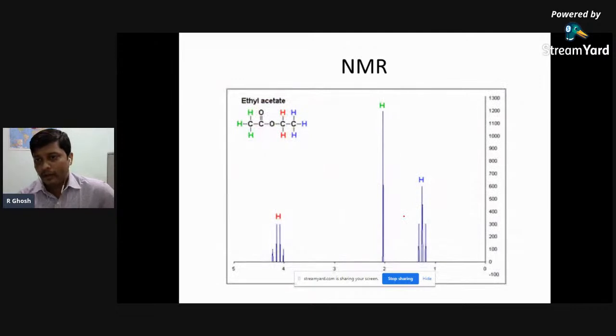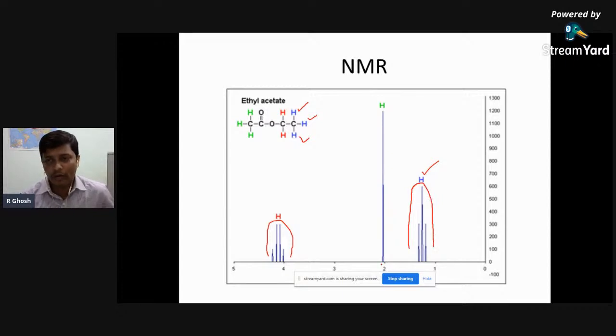this spectral data, so you can find in this particular spectral data the CH3 is one type of proton. So this whole 3 protons are coming all together here. Now, don't think about all these things. This splitting pattern has been shown for their neighboring protons. We are not going to explain all these things here, because at that time it will not be that helpful for you people, because it is 3 different types of proton we have to keep in our mind.